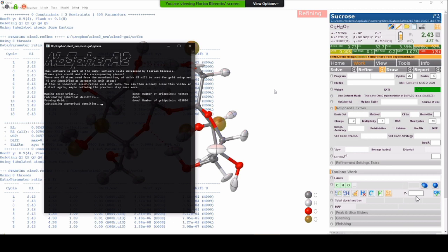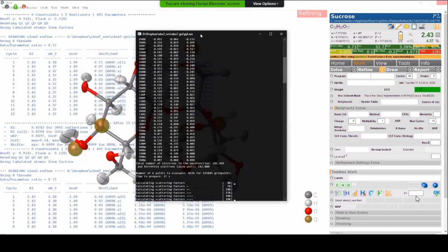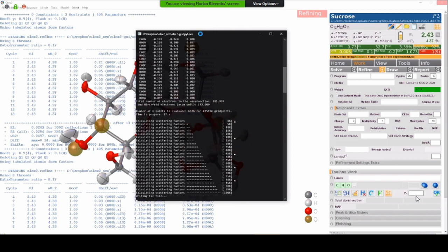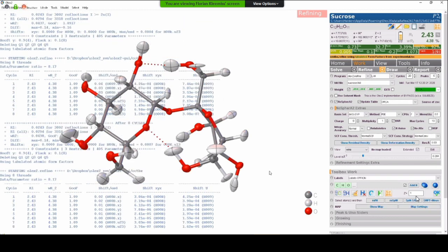The atoms were just moving off the special positions and then exploding the structure. And Olex2 refine is very good in handling these kinds of things because it is handled very well in the independent atom model, the standard spherical refinement already. And we can use this type of functionality now also in our aspherical refinement.